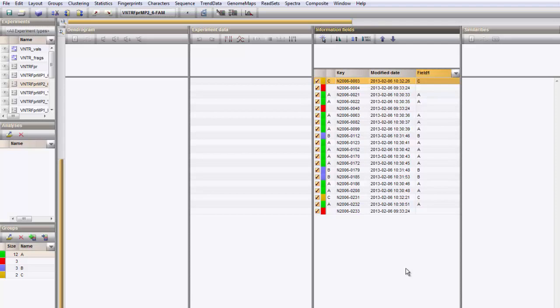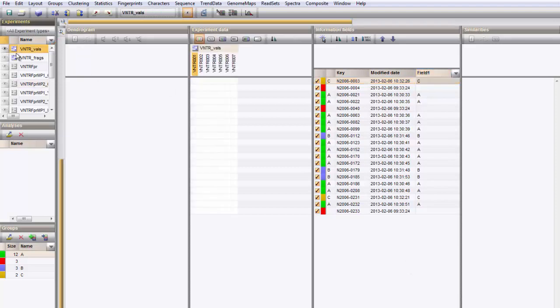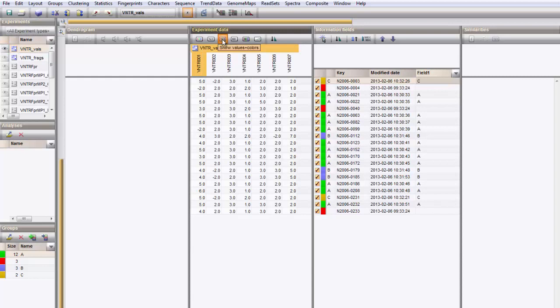Display the VNTR values by clicking on the icon next to the experiment VNTR VALs. The VNTR data in this character set can be analyzed in Bionumerics with all tools that are available for character data.